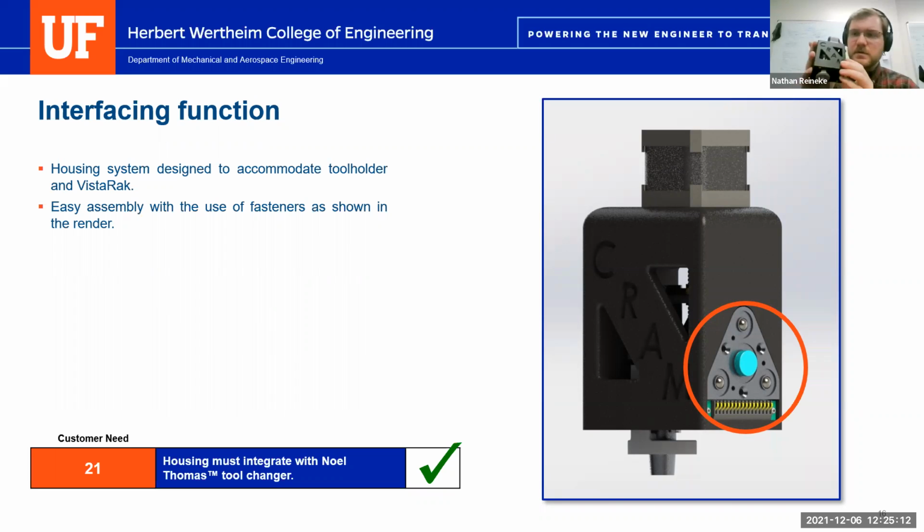So the cables themselves, if you see where these holes are right here, run up the side of the housing unit until they connect right to the top of the motor. Right now, this is just a preliminary prototype. The limit switch is also right here, which you can't really see, but the wire also runs up along the same side. Well, it doesn't run that far because it's just going to here.